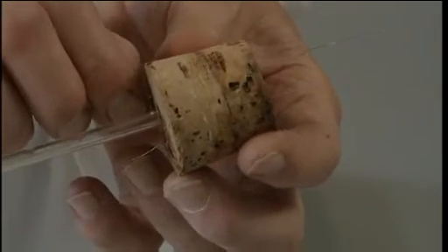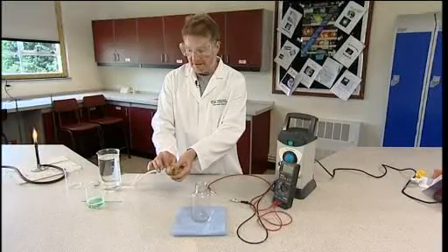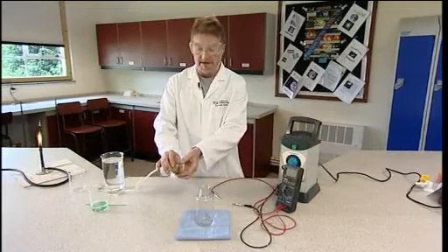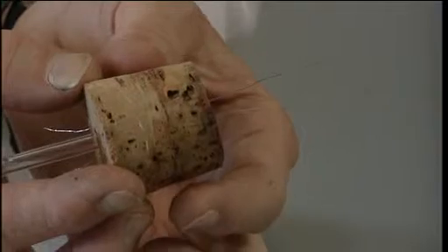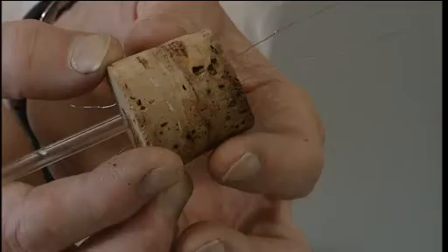These electrodes need to be an airtight fit. The positive electrode where the oxygen is discharged has to be platinum. The other electrode can be almost any other metal — copper, iron, nichrome. The electrode where the oxygen is discharged has to resist chemical attack by the oxygen.